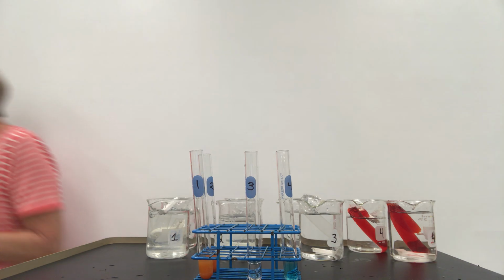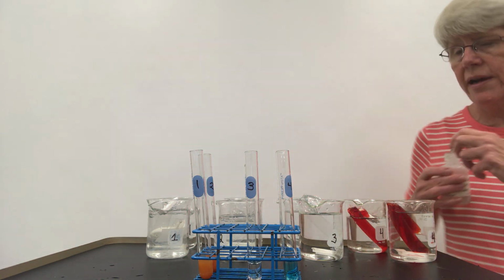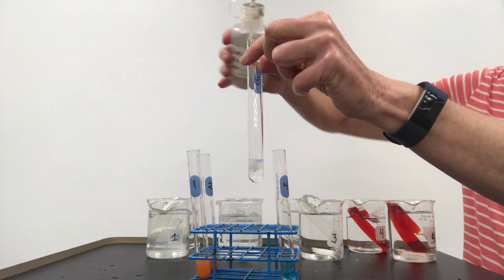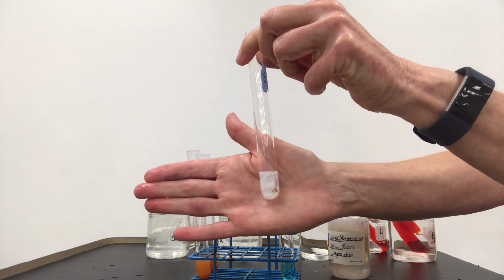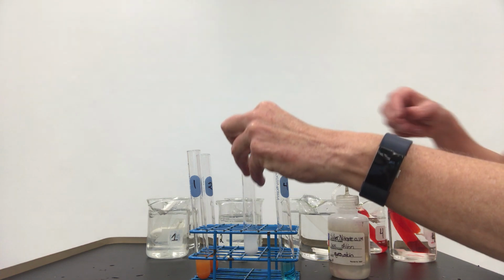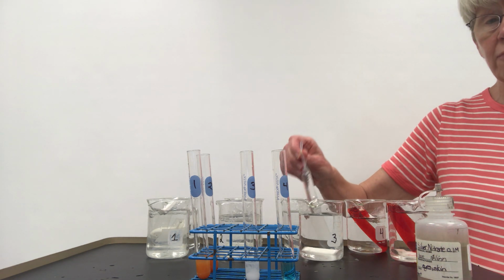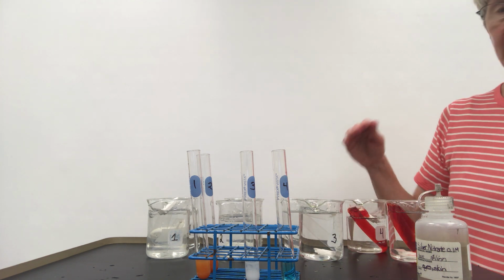Unfortunately, there's no color. Okay, I'm grabbing the silver nitrate so we can actually perform the silver nitrate test on the fluid from beaker 3. And you'll see as you drop it into the test tube that there is a white precipitate being formed here, which indicates the positive test for the presence of the sodium chloride. Actually, it's silver chloride that is forming. And that means that the sodium chloride was able to also pass through that selectively permeable membrane. It is much smaller, breaks down to little ions, and it can pass through.